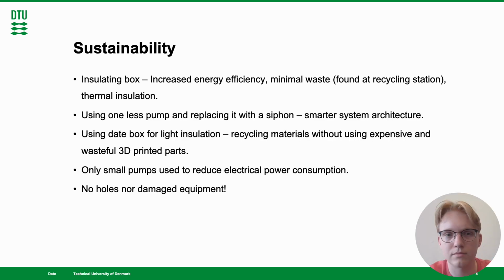For sustainability, we made a lot of improvements to our system. These were insulating the box, using a box from the recycling center to make the cooling more energy efficient. We used one less pump by replacing it with a siphon, meaning we are using less power. We used a recycled date box for light insulation of the OD sensor. We only used the small pumps as they require less power. And lastly, we didn't put any holes in any of the buckets.